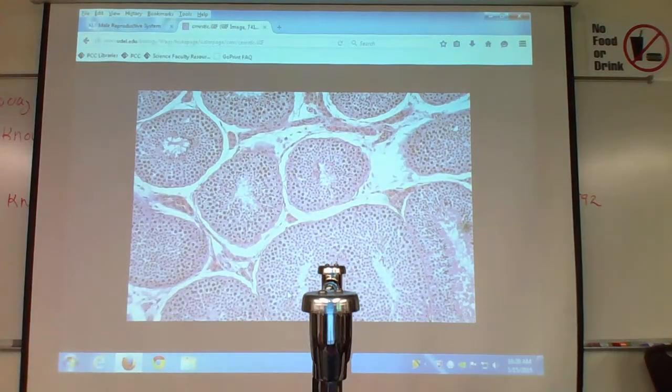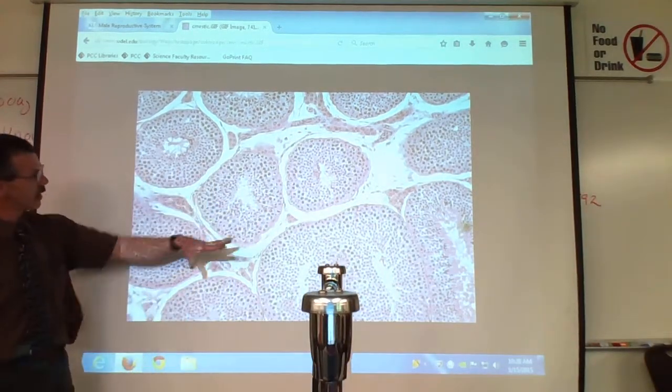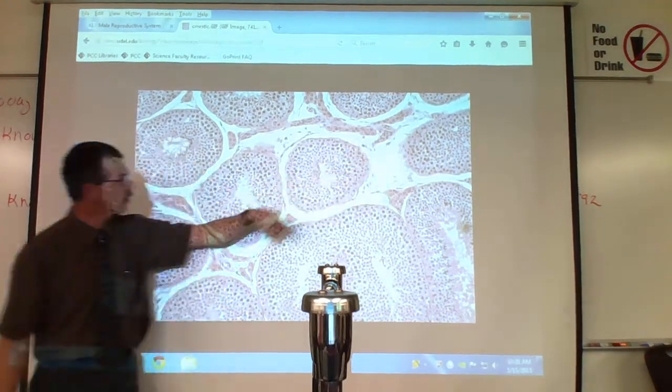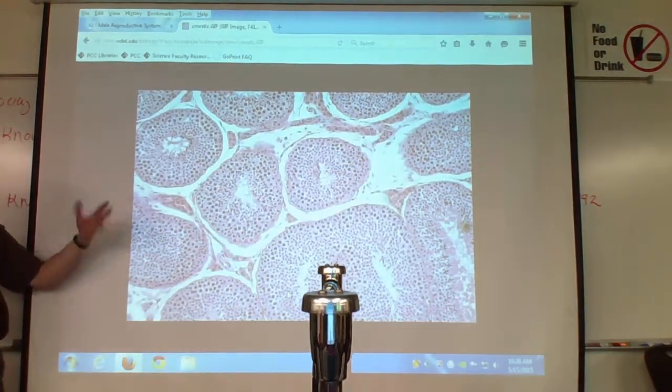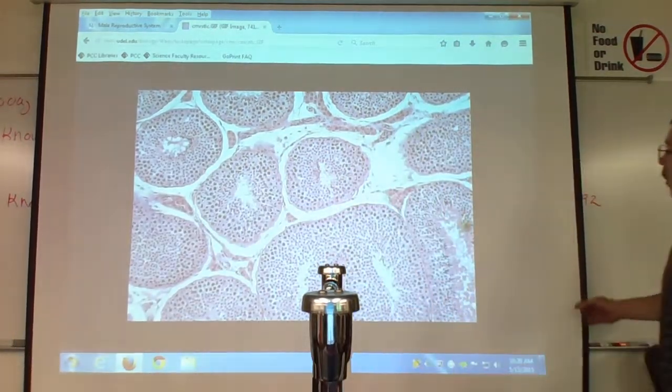Name it and claim it. You sure? Yes, I am. So big full circles, usually they're not always perfectly round. I see the interstitial cells that are not the circle. I can make out the sperm in the center. You kind of get the gist. If I stare long enough, I probably can.